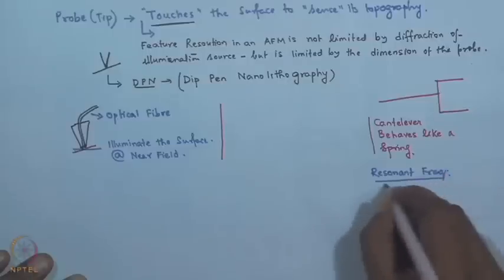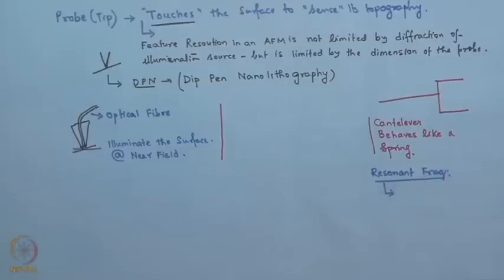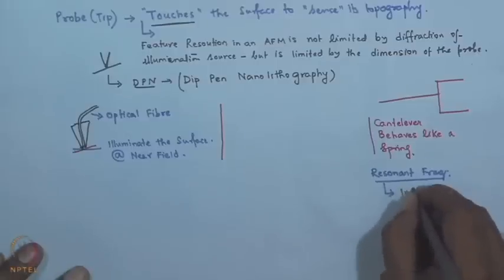This is utilized in a large way in tapping mode or the intermittent contact mode.